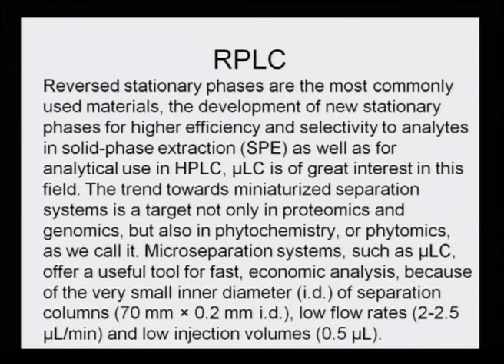RPLC, reverse phase liquid chromatography. The reversed stationary phases are the most commonly used materials, particularly in phytochemical analysis. The development of new stationary phases for higher efficiency and selectivity to analytes in solid phase extraction, as well as for analytical use in HPLC and microLC, is of great interest in this field.